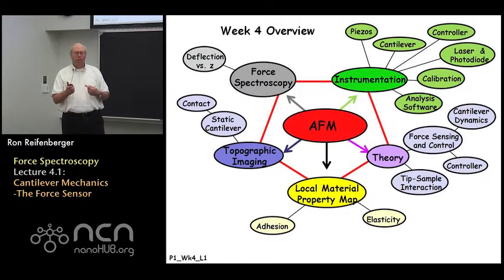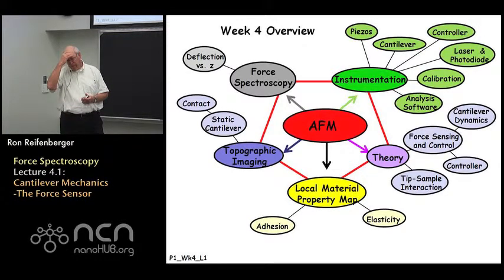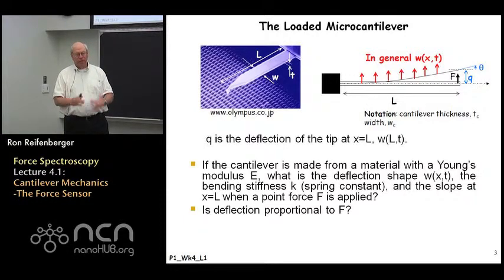So we'll do a lot of discussion about how to analyze data that you obtain, not in the dynamic mode AFM, but in the case when the cantilever is static, you just push the cantilever up against a substrate. We'll try to describe the variety of different pieces of information that you can get from this really simple experiment. Today, in this lecture, we're going to really talk about the microcantilever and try to get equations that describe how this cantilever bends when a force is applied to the end of the cantilever.